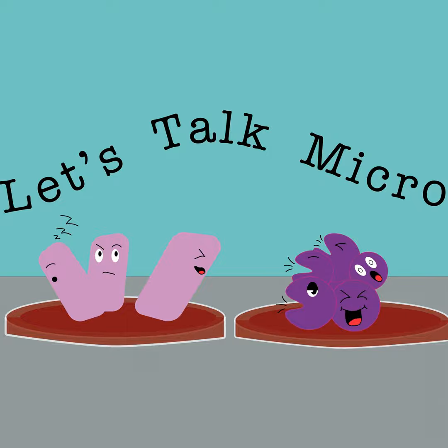I'm very lucky in that I had help putting together the kits and the boxes and the slides, but I know that there was a lot of pressure on the people that were helping me to get it all out to the students ahead of time, because they came and picked up the scopes, although we could have mailed them if it was necessary. When they registered for the course, they were told that they would have to come once to pick up the materials and another time to bring them back. But that didn't end up being a big problem. We really were able to work around their schedules to get the scopes to them and then pick them up.